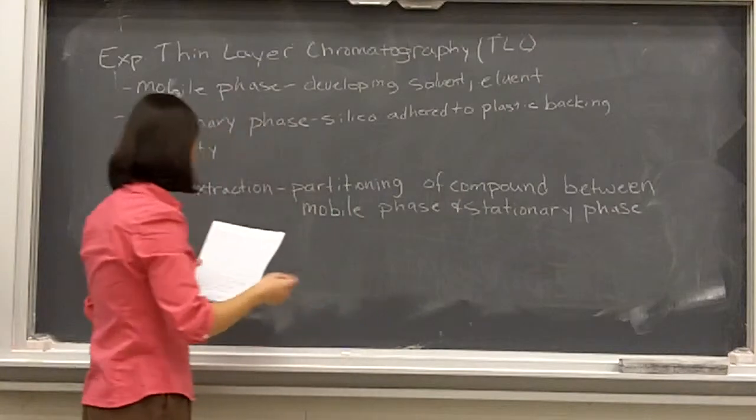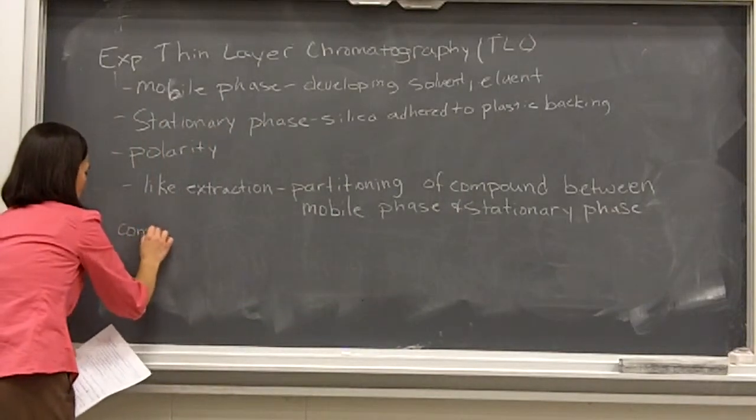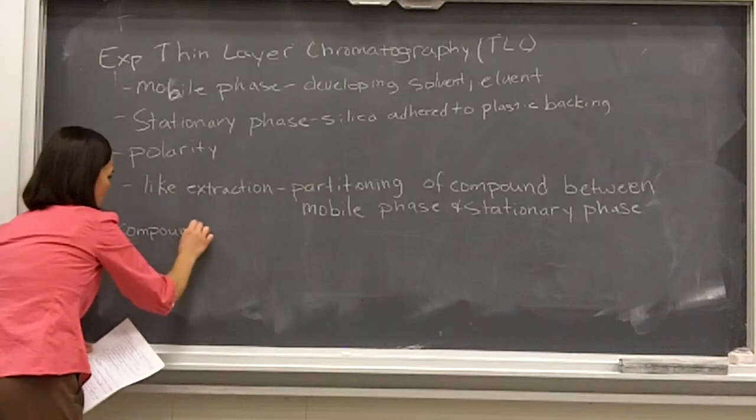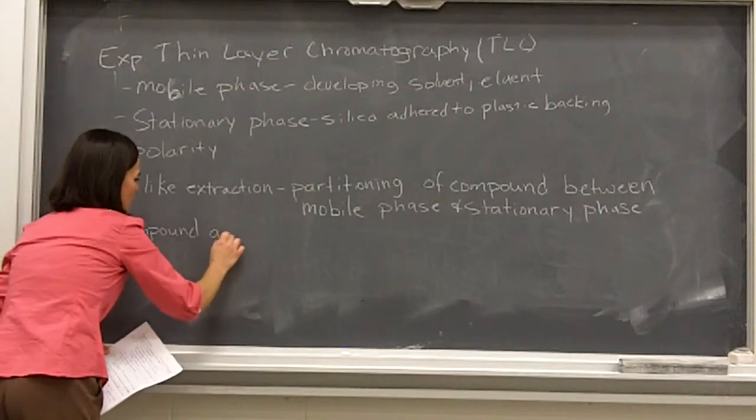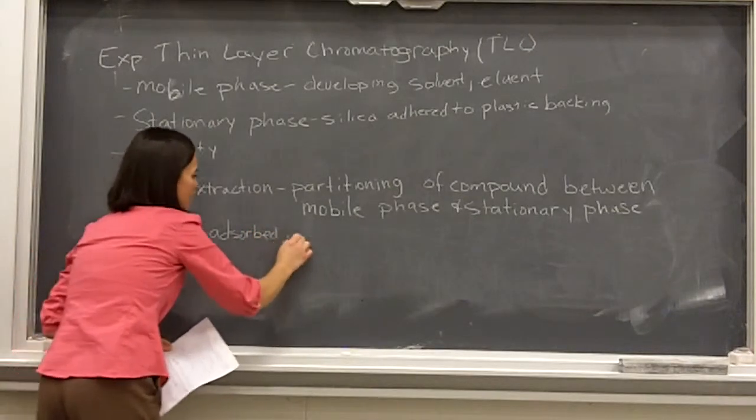So we've got this equilibrium that gets set up of the compound being what's called adsorbed on the silica.